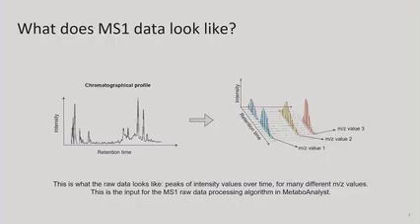So this is the sum intensity of all ions. When we go into the details of this data, we can find more information from another dimension, m/z. We can see that at the same retention time, there are clearly different m/z values. This is called an MS feature. We have to find these MS features because they are highly related to the compound information in this data.